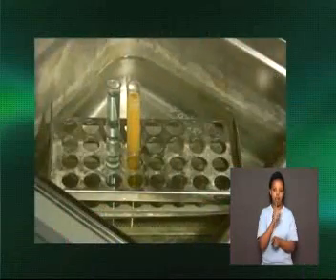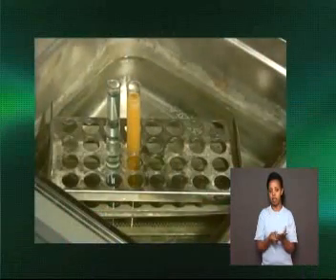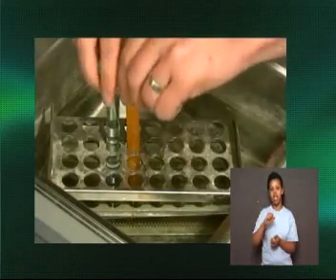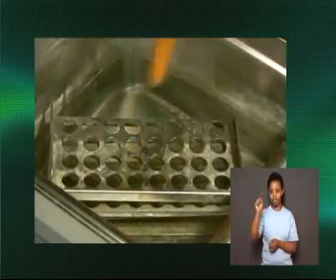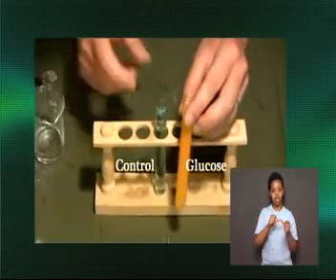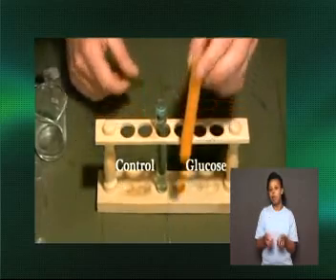To test for the presence of monosaccharides, maltose and lactose, a small amount of food is added to Benedict's reagent and boiled for several minutes to test for the amount of reducing sugar present. Boiling happens for 4 to 10 minutes.